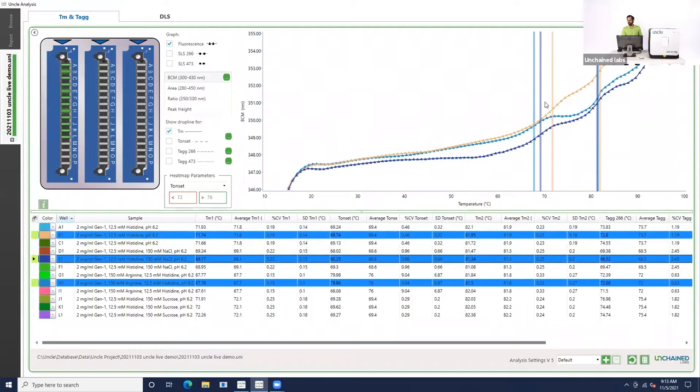We can also take a look at the sodium chloride sample. There we have a TM1 that's right in between the TM1 for the arginine sample in light blue and the TM1 for the histidine sample, which is the peachy color. All of the TM2s are actually pretty close together. So analyzing those results right off the bat, I'd definitely be focusing more on TM1 than on TM2.